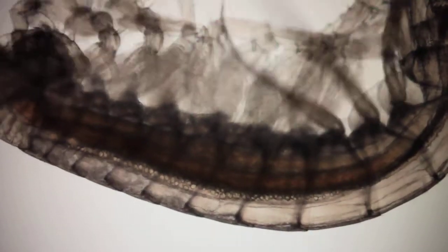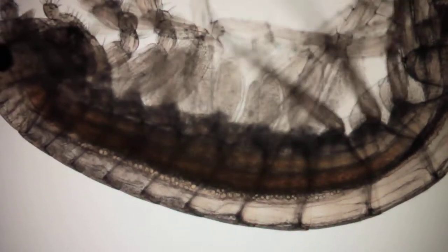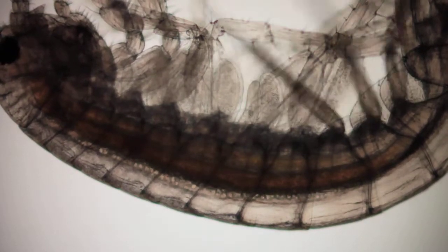She's quite active. What I've got her on is a slide with a depression in it. I have made it deeper by putting four dots of nail polish around the center depression to make a little thicker stand there when I put the cover slip on it. Yeah, she's got eggs there it looks like.